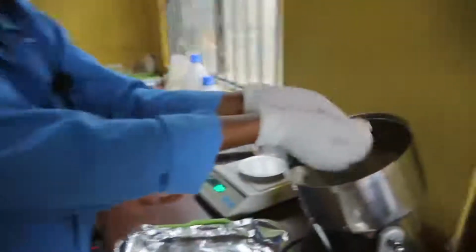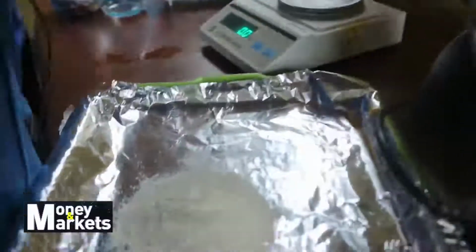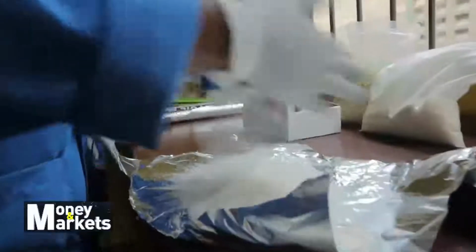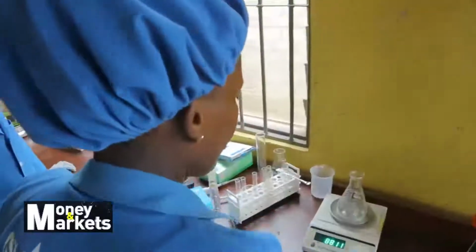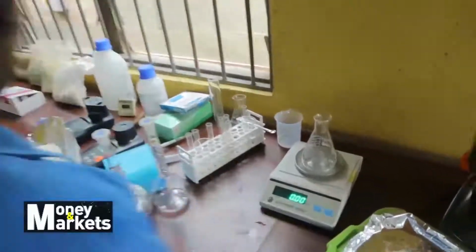Now after grinding your sample, put it here. Make sure you have blended it very well. You sieve the sample. You sieve your product. So weigh 10 grams.